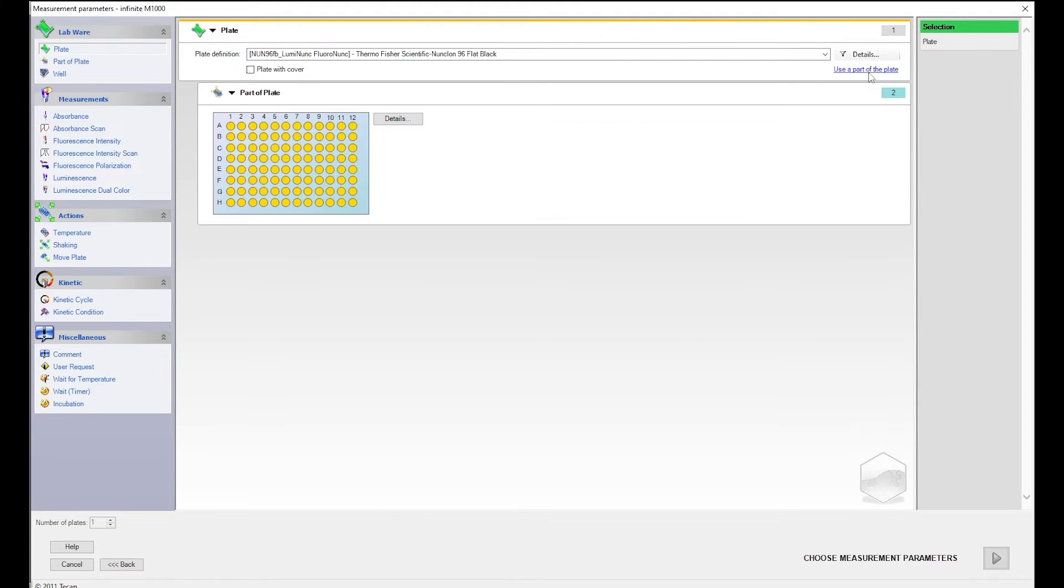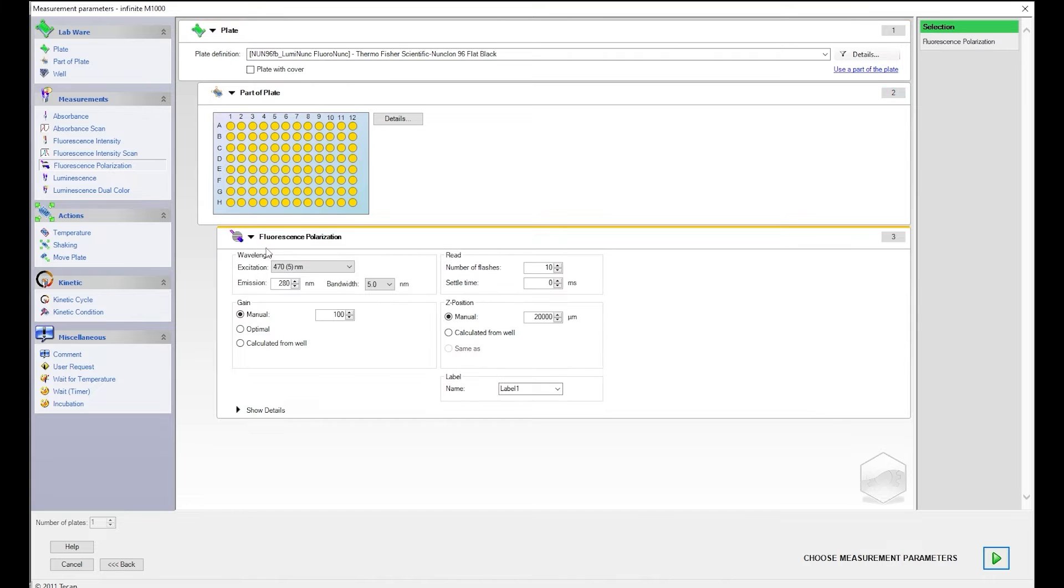From Measurements, drag and drop fluorescence polarization into the Method section nested below part of plate. Under Wavelength, select the desired excitation and emission. Set Bandwidth as needed. We recommend 10 nanometers.